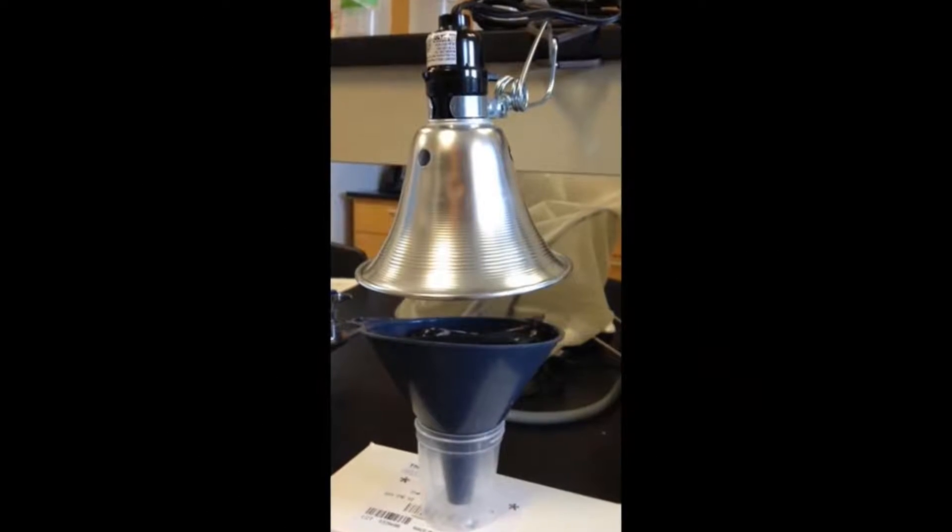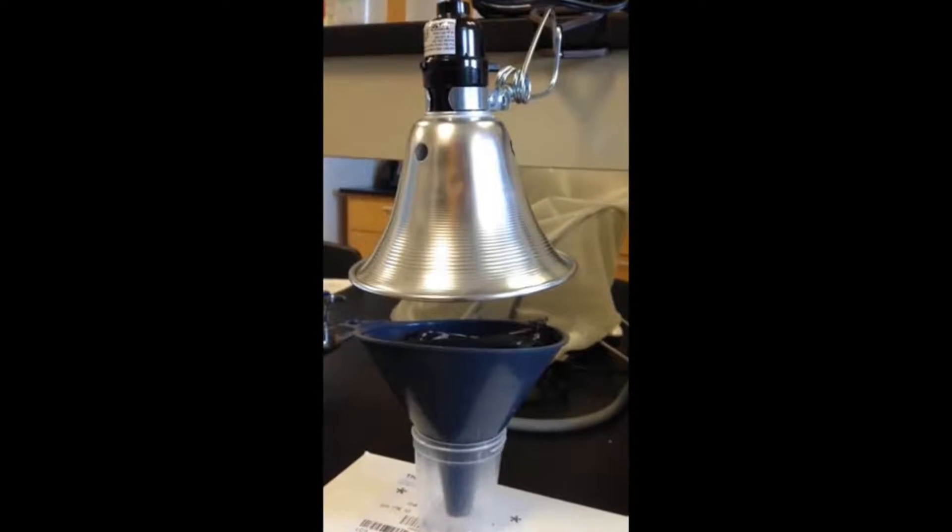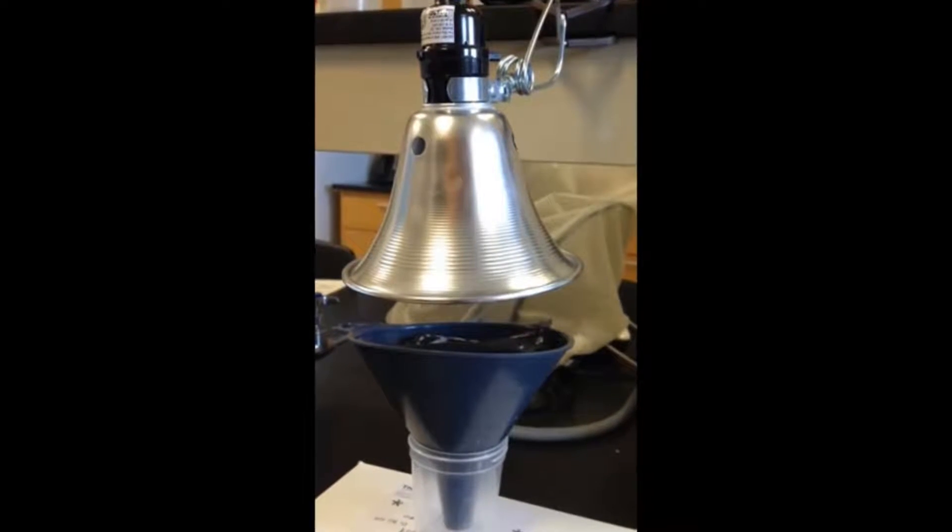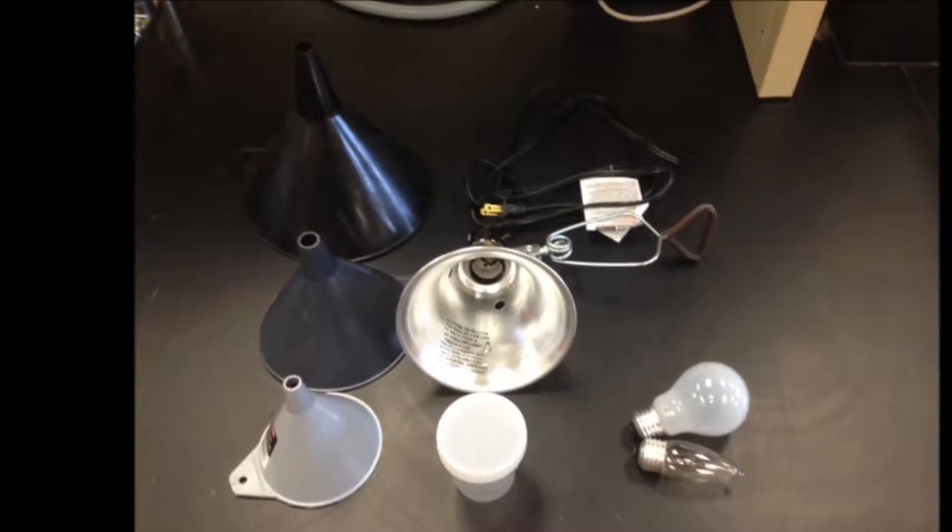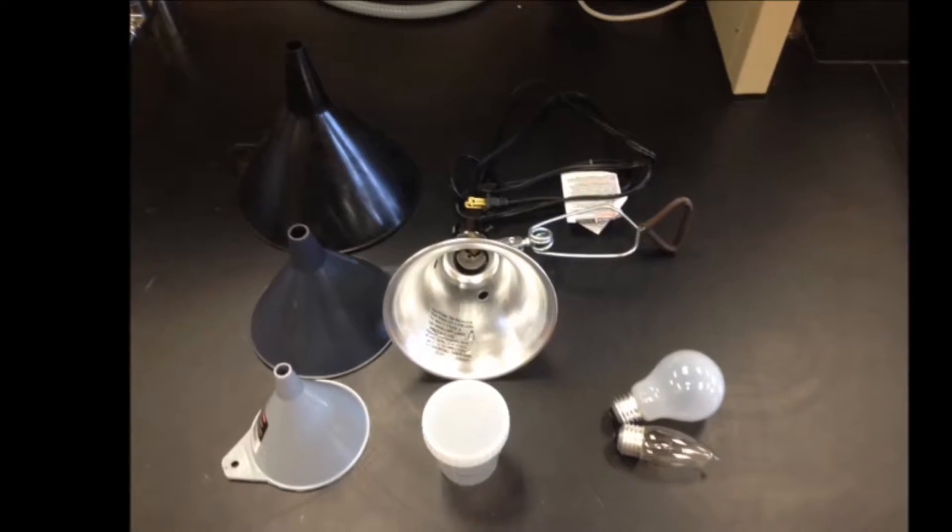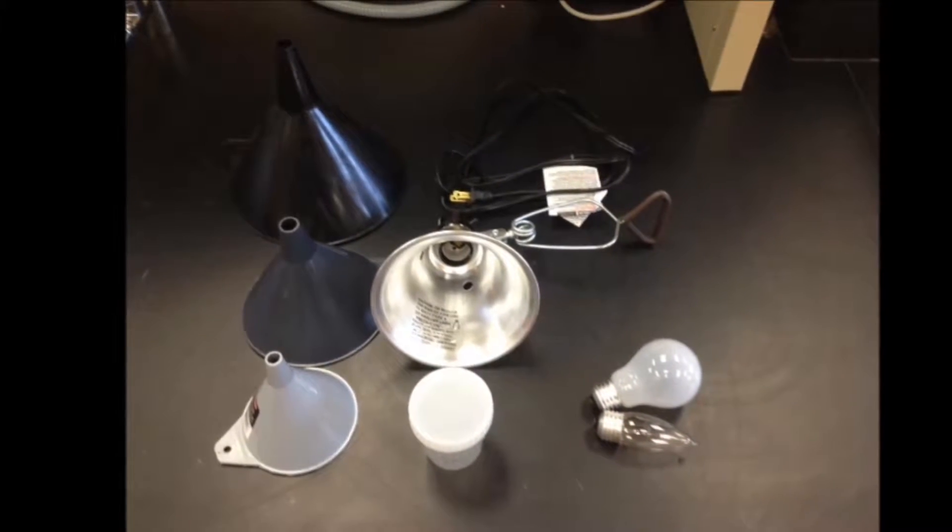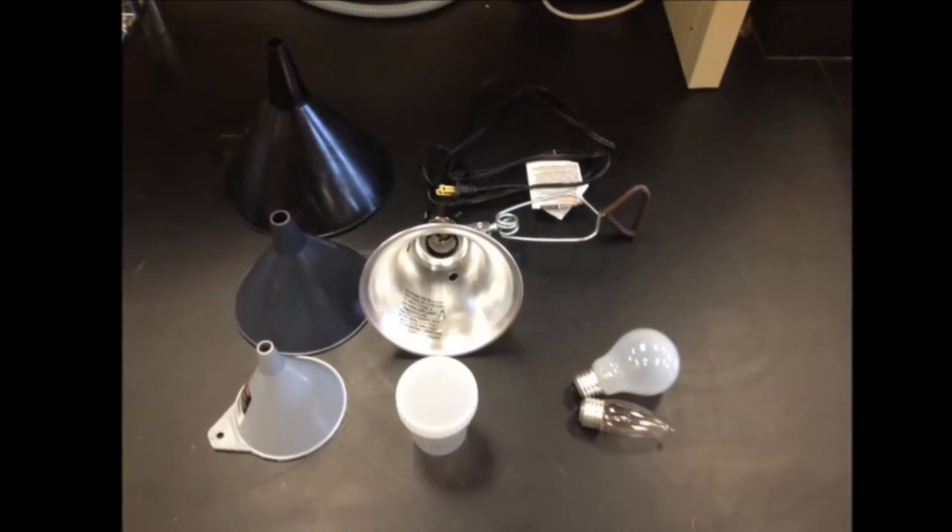The first one we'll set up is the one you see here. It's a bit larger but great for using with a litter bag. You'll need a plastic funnel, of which there are several different sizes, a clamp-on light and either low or higher wattage light bulb, and a plastic cup for collecting your specimen.